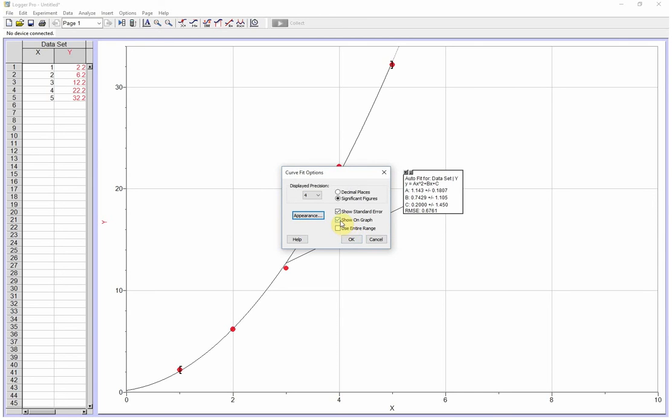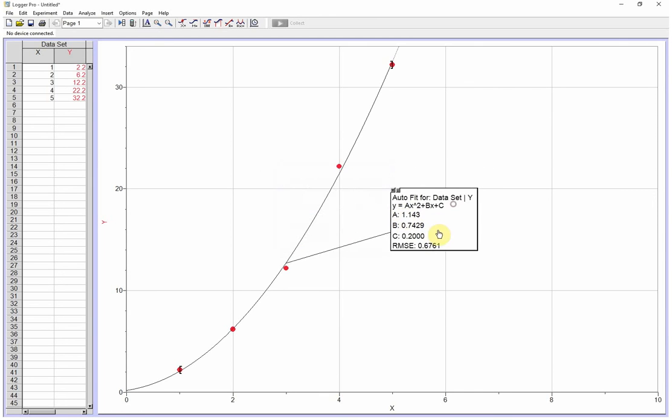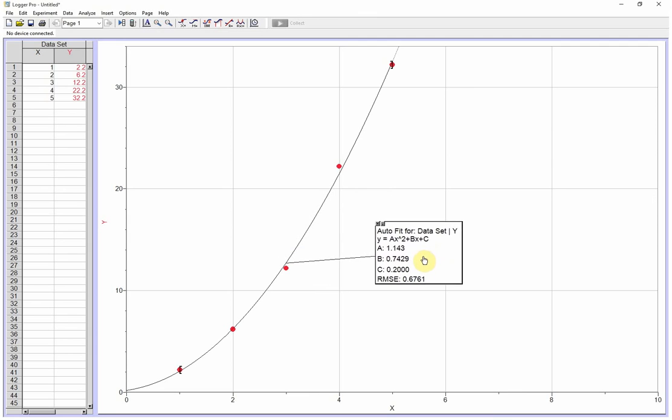I don't need my error here, show standard error. We don't need that. So there's my A, B, and C.